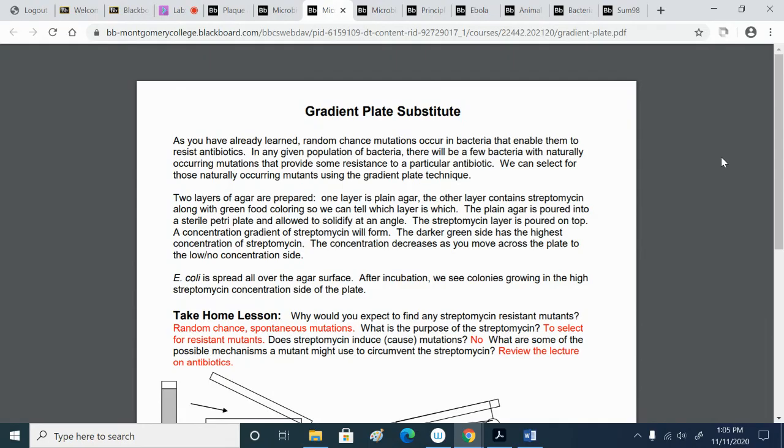What we're going to do today is show that experimentally, by something that you would have done in class. And remember, we also saw this kind of thing in the Harvard video, which had that large 4-foot rectangular petri dish. We saw E. coli mutate and change and become more resistant over a period of about 11 days. We do a much simpler experiment to demonstrate that there's already some resistant bacteria present. We're going to be using E. coli and the antibiotic streptomycin.